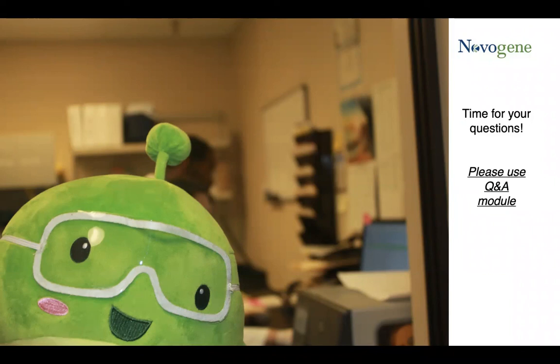This is also a very good question. Honestly speaking, this really depends on how degraded the sample is. After our sample QC, if we can see the main band clearly, with some short fragments, I recommend we filter out the short fragments and increase the sequencing data amount to get enough data. But if we cannot find the main band, based on the project experience we have, I would suggest trying risky library preparation for one or two samples and seeing how the result goes.